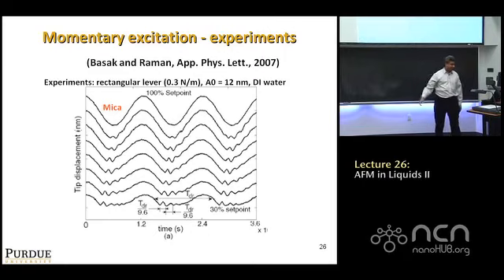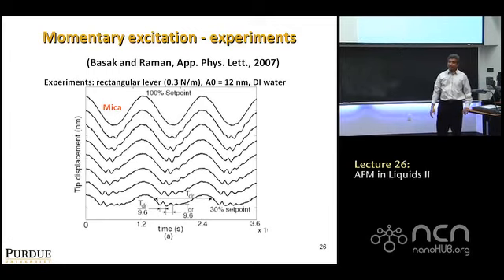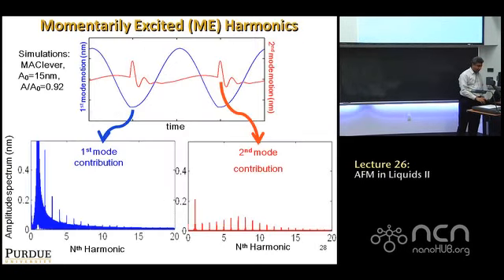It's of course not easy to do because in AFMs you're using lock-in amplifiers. You don't have access to these nice signals. Usually you're using lock-in amplifiers. So the question is, if our task is to figure out the extent of this distortion at the bottom, and it occurs once every oscillation cycle, how to do it? One way to do it is the following. It's just a conceptual idea.